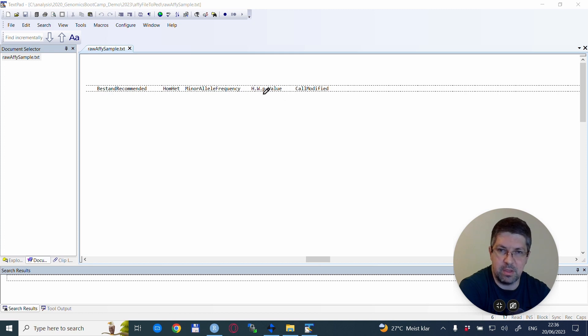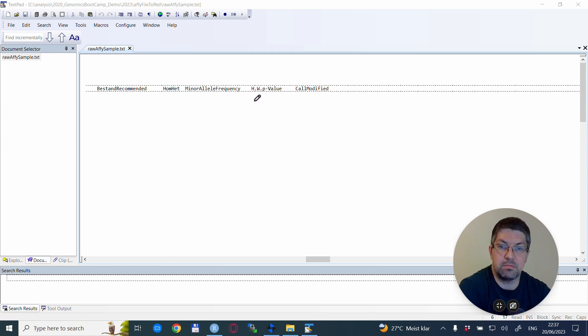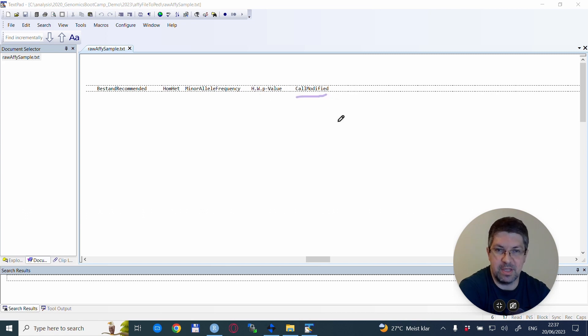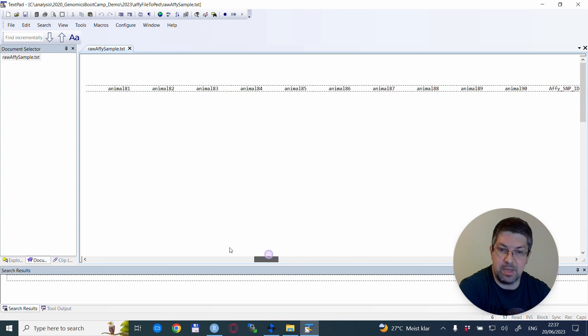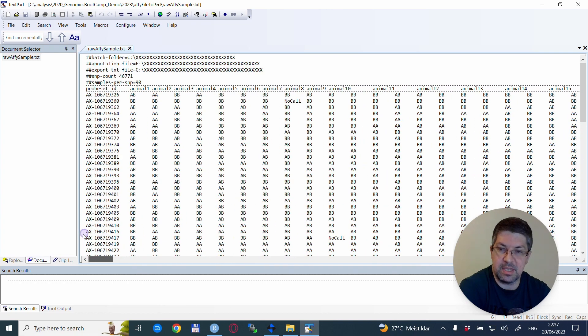Because all the other column names are either camel case or some kind of solution that doesn't have a space in it, except this 'call modified,' which would then cause problems when loading into R. So I changed that one manually. Anyway, our task is to change this one to a plink file.